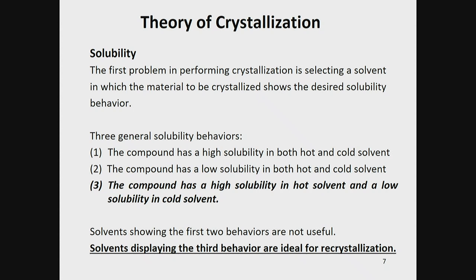So you want to look at these three general solubility behaviors, and then you can understand a little more about what I'm getting at. And remember, to be soluble means to dissolve. The first one is the compound has a high solubility in both hot and cold solvent. The second behavior is the compound has low solubility in both hot and cold solvent. The third behavior is the compound has a high solubility in hot solvent and a low solubility in cold solvent.